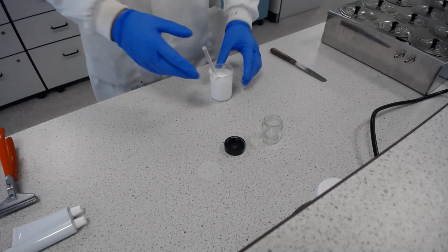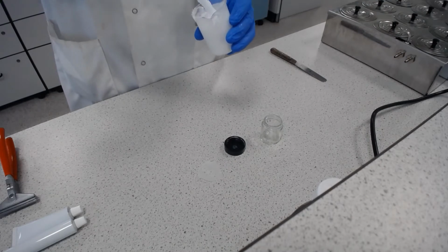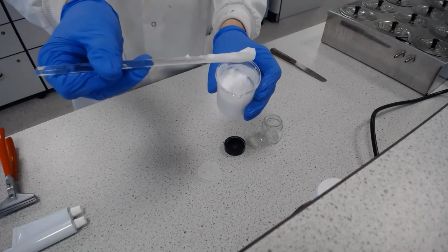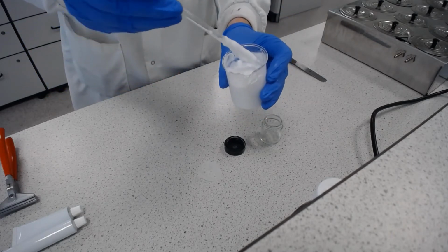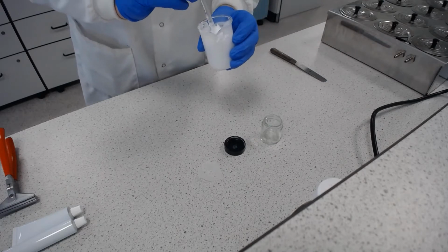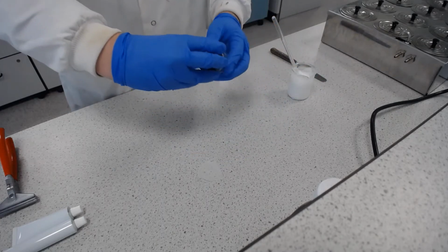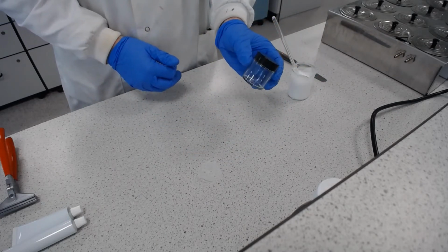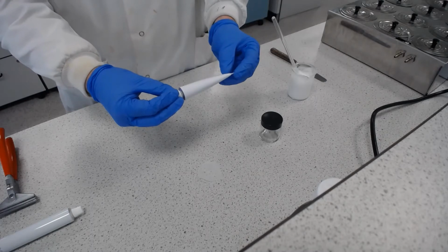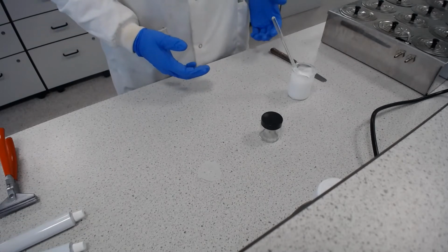So we've waited about 10 or 15 minutes, and the cream has now got to room temperature and is no longer a liquid, but a semi-solid. You can see that that is going nicely on our stirring rod, and it looks a nice creamy, white, smooth consistency. So we need to get that into either a little pot of cream, or a tube, which you would have no doubt seen and used before. That's why I've made double the amount, so I'm going to do both.